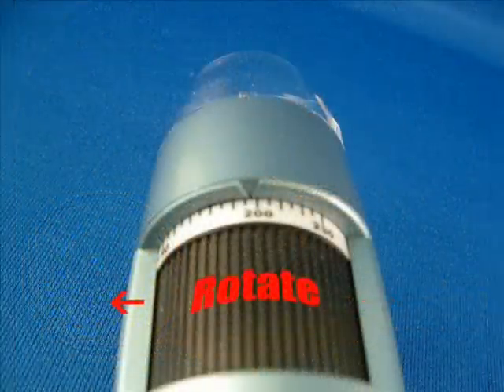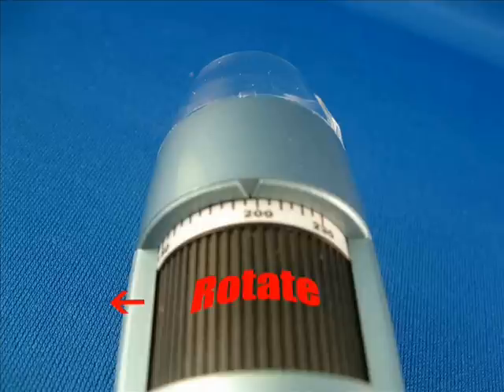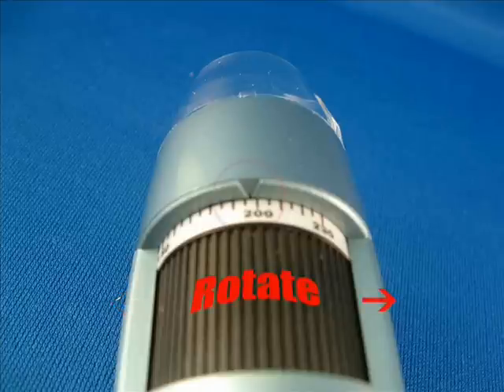Adjust magnification value by rotating the knob to the left or to the right. You can see the magnification value from the arrow that's pointing to the number.